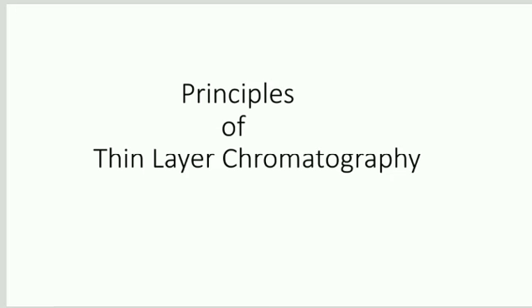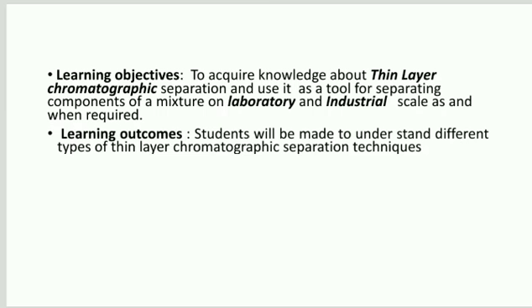Principles of thin layer chromatography. Learning objectives. To acquire knowledge about thin layer chromatographic separation and use it as a tool for separating components of a mixture on laboratory and industrial scale as and when required.